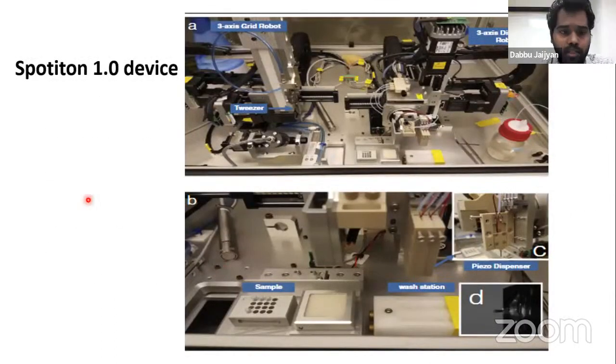So this is the image of the Spotiton 1.0 device. Here you can see you have a 3-axis grid robot. This is a tweezer here, which can move the grid in 3 directions: upward, downward, or horizontal. And this is a 3-axis dispenser robot, which contains the piezo tips that can take the material and transfer it, or spot it, onto the grid.